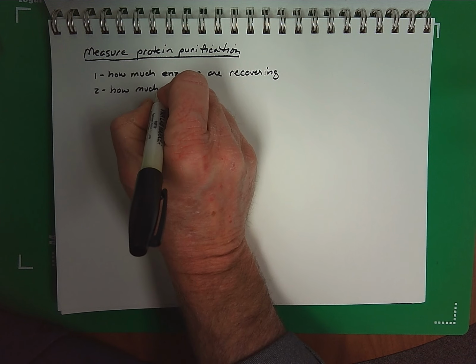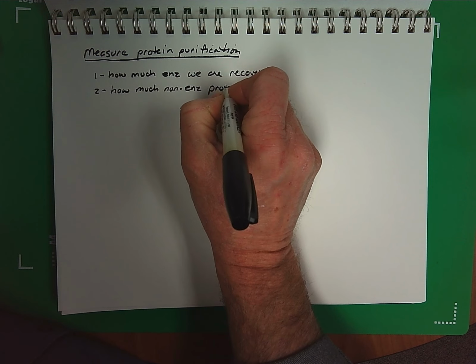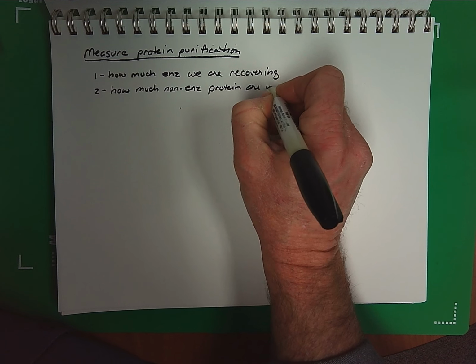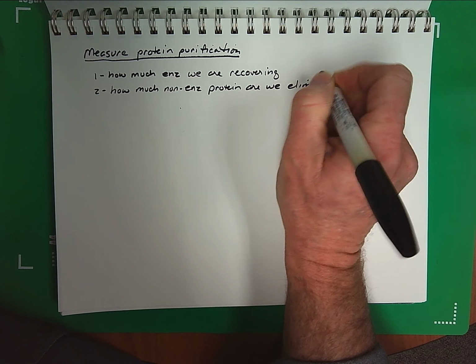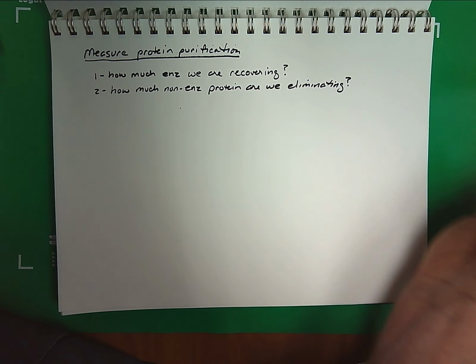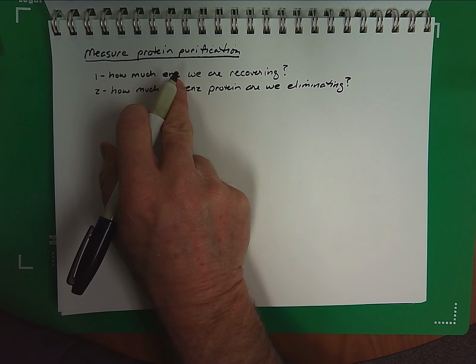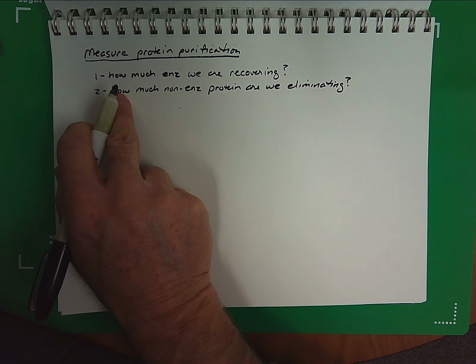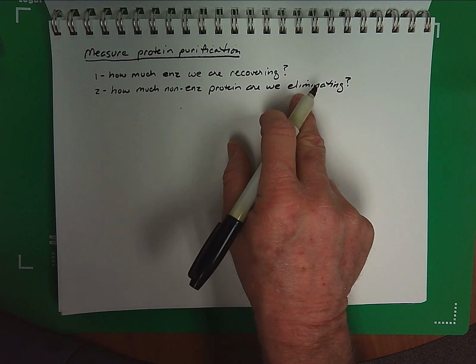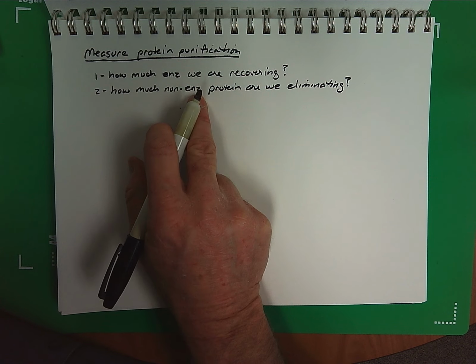and second, how much non-enzyme protein are we eliminating. So during protein purification, what we want is pure enzyme, single molecule that we're studying. We need to remove all other protein. So we need to measure the enzyme we're recovering and measure how much of the protein that we're not interested in we're getting rid of.